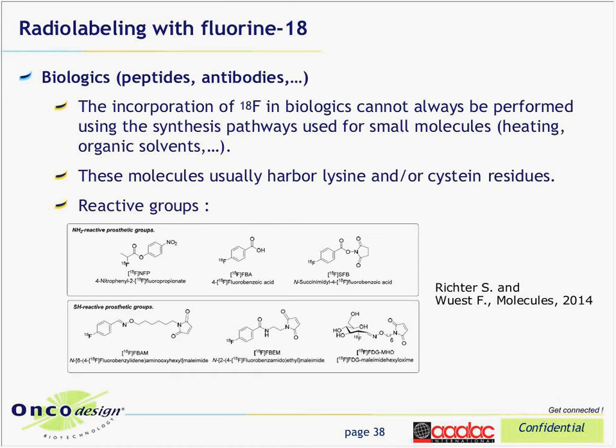However, you may not be able to use the specific conditions for biologics, mainly peptides or antibodies, as used for small molecules, because sometimes the reaction mixture has to be heated, or because of the use of organic solvents that may not be compatible with biological molecules. These molecules usually harbor lysine and/or cysteine residues, and you have an example from the literature just to show that structures reacting with NH2 groups or SH groups were developed to be able to label biological molecules with fluorine 18.